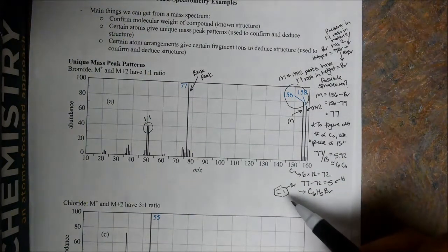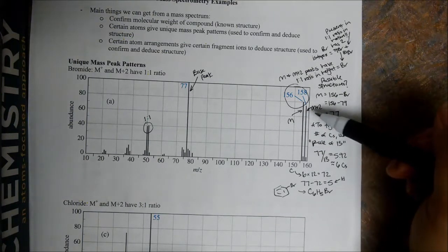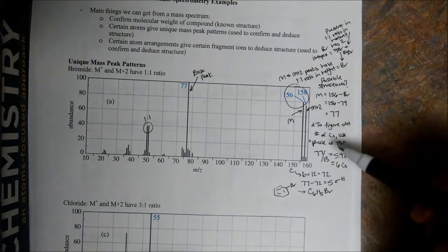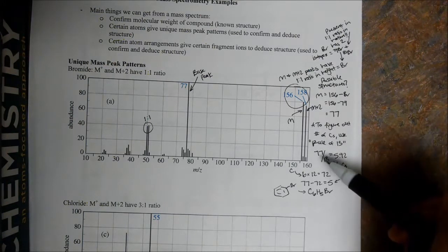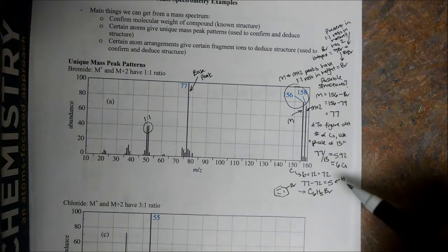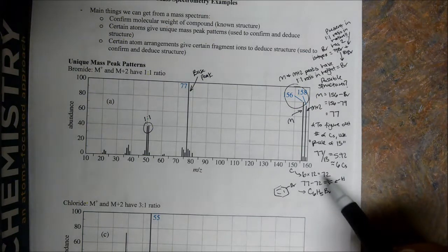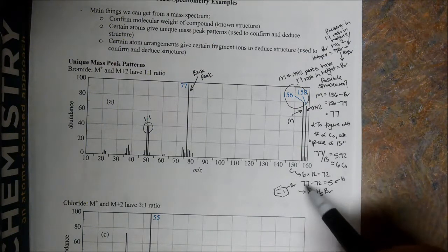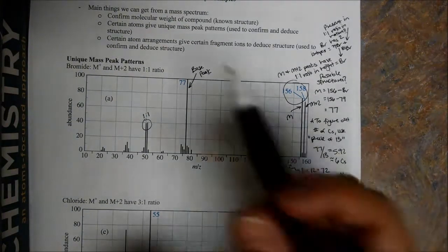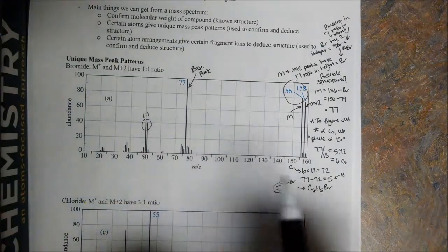What I want you to take from this discussion is looking for the M and the M plus 2 ions being in a 1 to 1 ratio. From there, we can possibly figure out the number of carbons by using the rule of 13, which is simply dividing the leftover mass units by 13 to get a rough estimate of the number of carbons in our sample. Then we take the mass of the carbon to figure out how many mass units are left. We have 72 mass units for carbon, so 77 minus 72 gives 5, so C6H5. Again, the main point here is that a bromine will have a molecular ion and an M plus 2 peak with a 1 to 1 ratio.